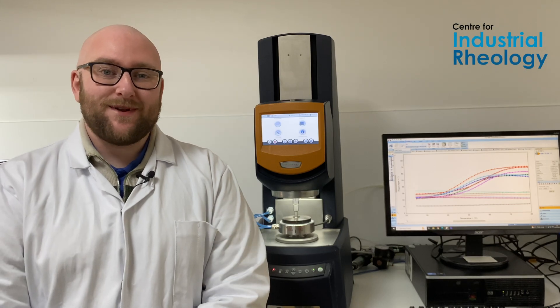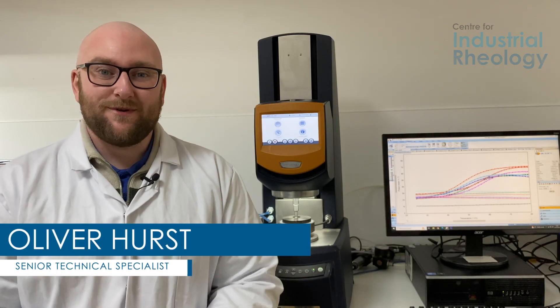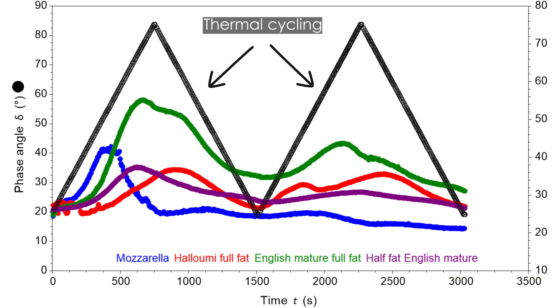Hey guys, we're back in the lab and today we're running some temperature sweeps. A temperature sweep is a great measurement where we can look at either the viscosity or the structure of a material and change the temperature while we're doing that to see how those changes in temperature affect our material.